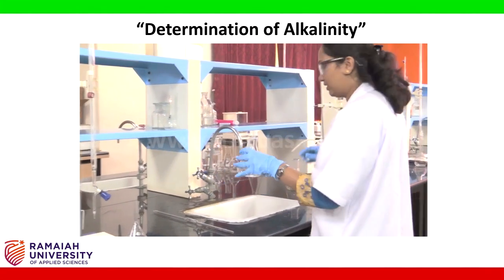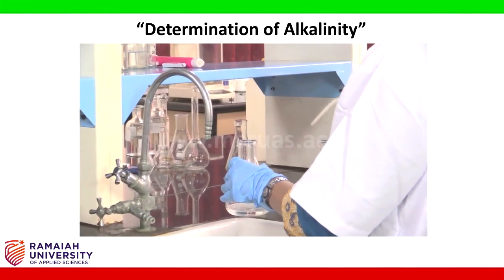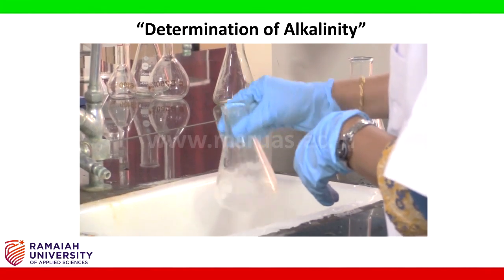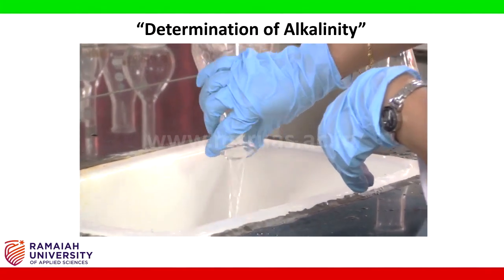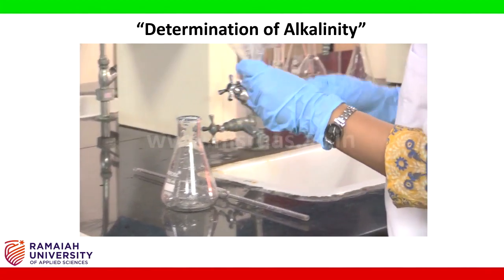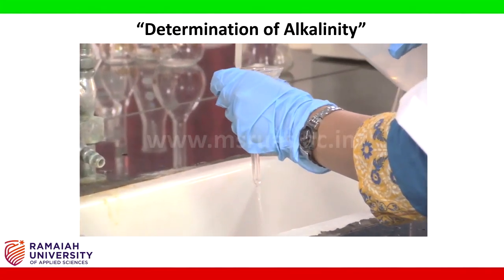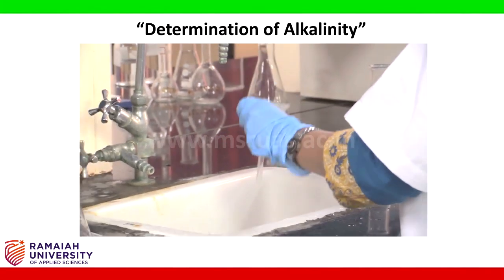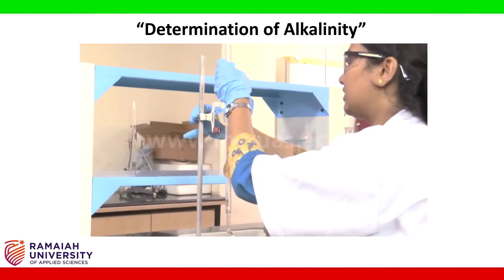Next, the conical flask. We'll also rinse the funnel. Then the burette.